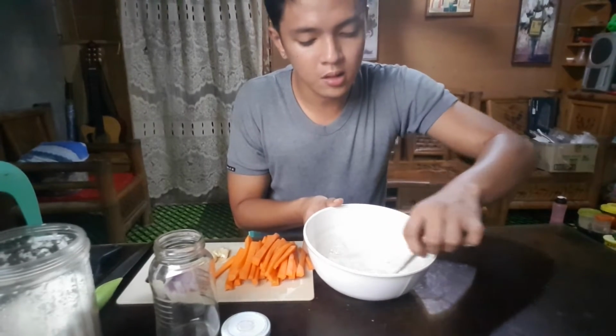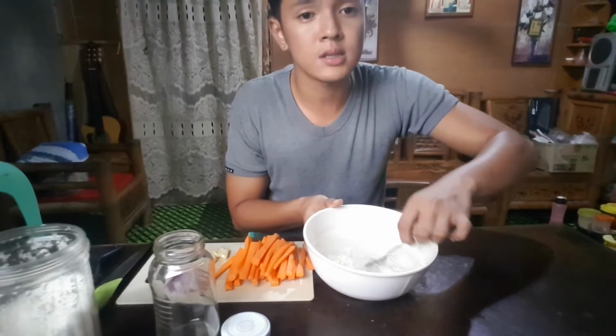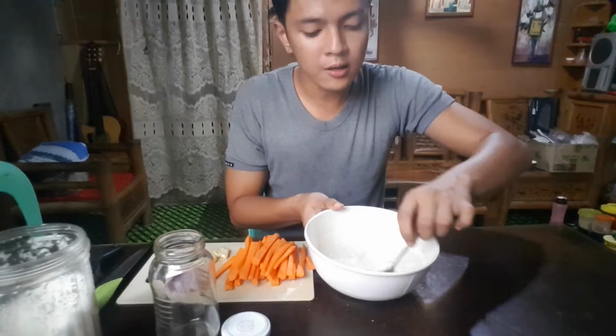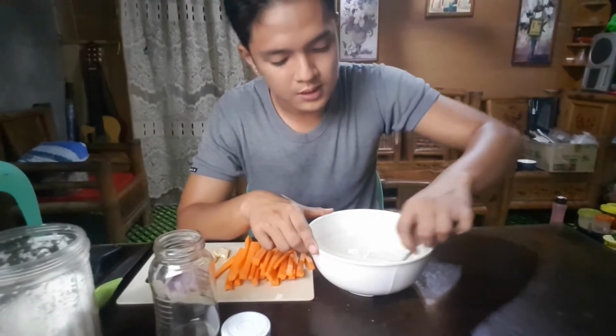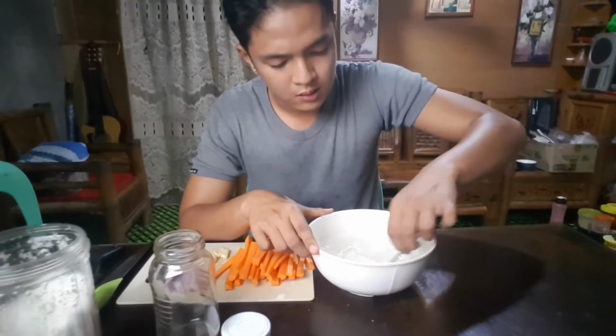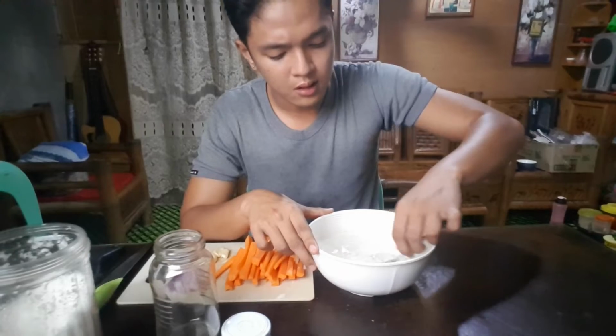Remember that 2% brine is enough and adequate for effective lacto-fermentation with vegetables. So stir well, make sure that water and salt are mixed well.